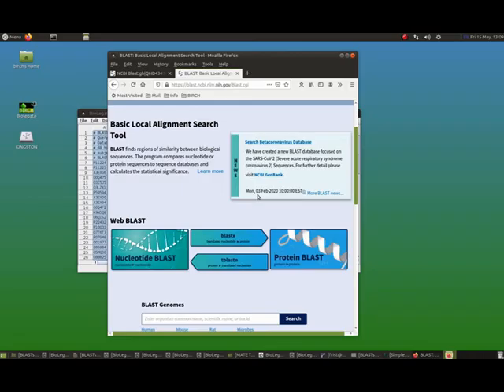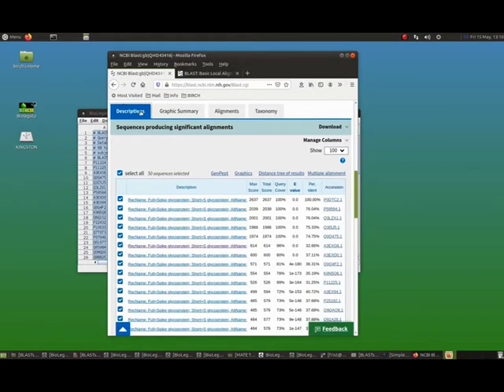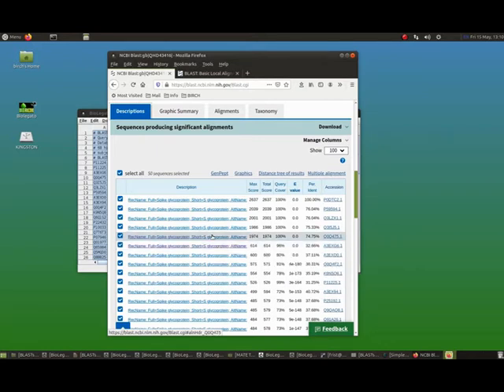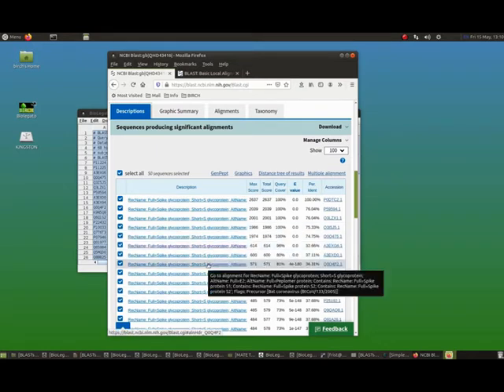So at this point, it's a good idea to compare the way we would do the same blast search on the NCBI website with what we've already done. And so if we go to the output, the first page of output that we get is a table of the hits, and this looks superficially like the BLP fetch output, but this is a static table. It's not a spreadsheet.